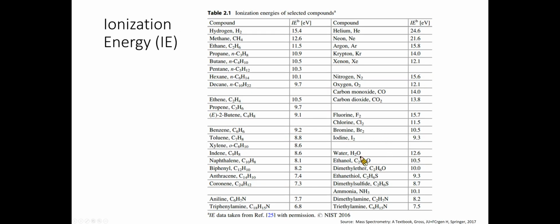The ionization energy is defined as the minimum amount of energy that needs to be absorbed by an atom or molecule in its electronic and vibrational ground states in order to form an ion that is also in its ground state by ejection of an electron. Ionization energies of most molecules are in the range of 7 to 15 electronvolts. Removal of an electron from the molecule can formally be considered to occur at a sigma bond, a pi bond, or at a lone electron pair, the sigma bond being the least favored and the lone electron pair being the most favored position for charge localization within the molecule, an assumption directly reflected in the ionization energy.